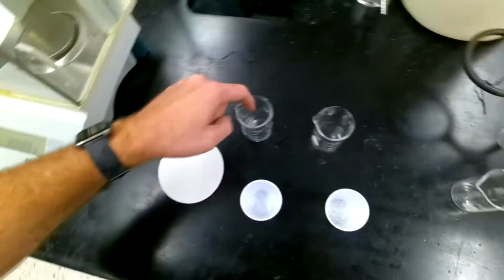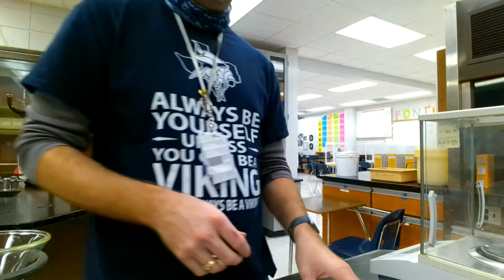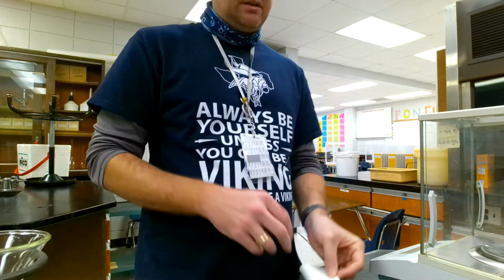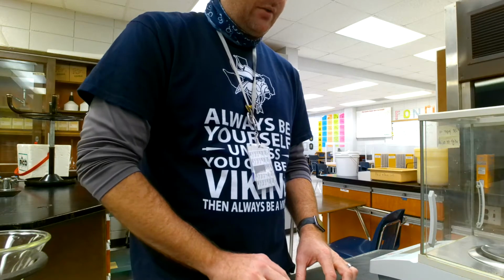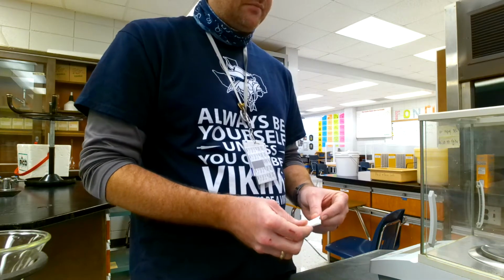You'll need filter paper and 2 beakers, and we are going to dissolve this in some water in the beaker, and then filter it through here. So let me show you how we fold our filter paper. You take your filter paper, and ideally you want to touch it the least amount of times possible. Adding oils can be a problem. So we will fold it first, and then fold it again.